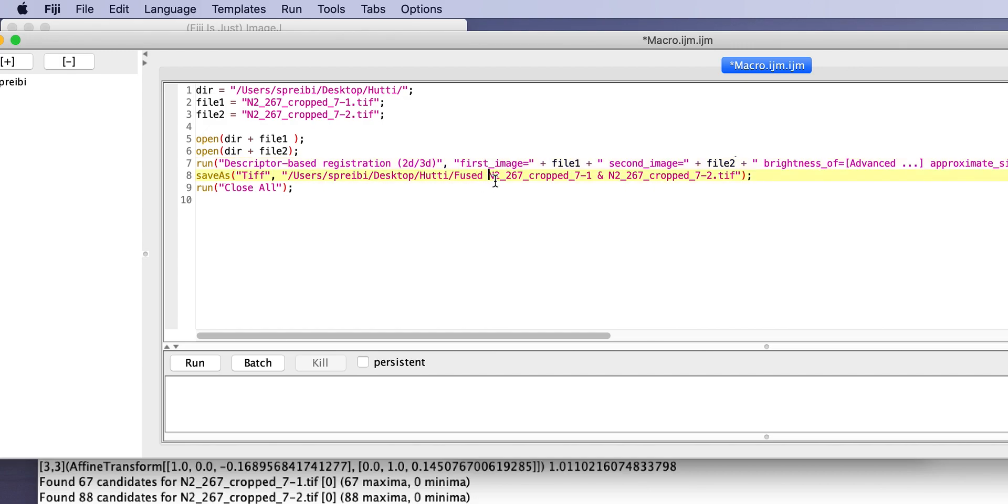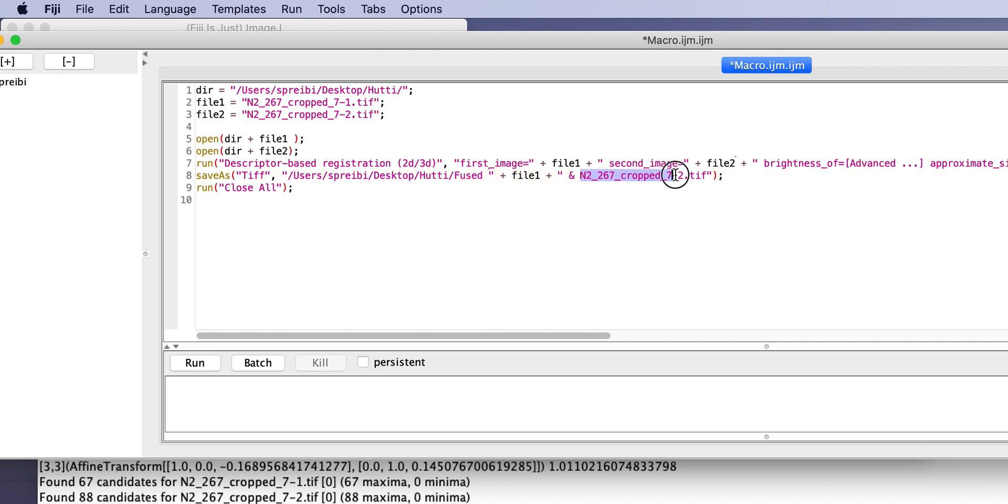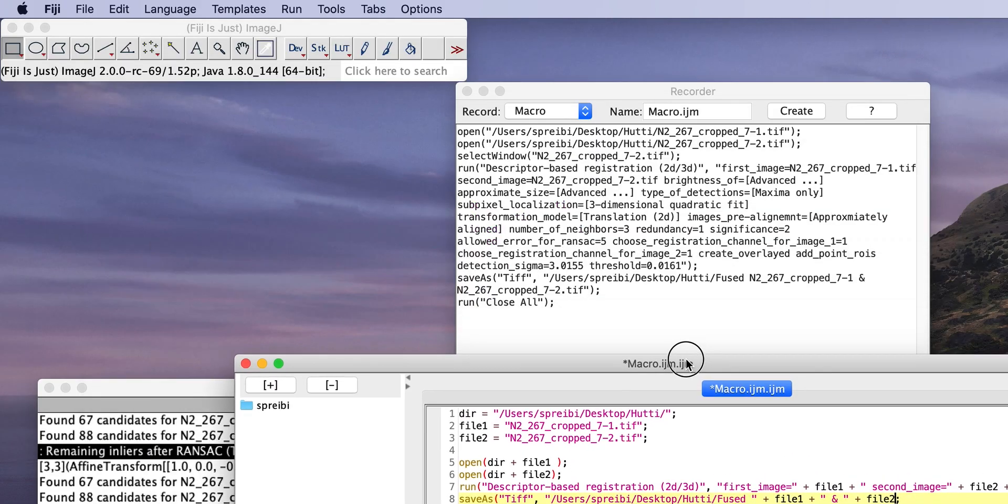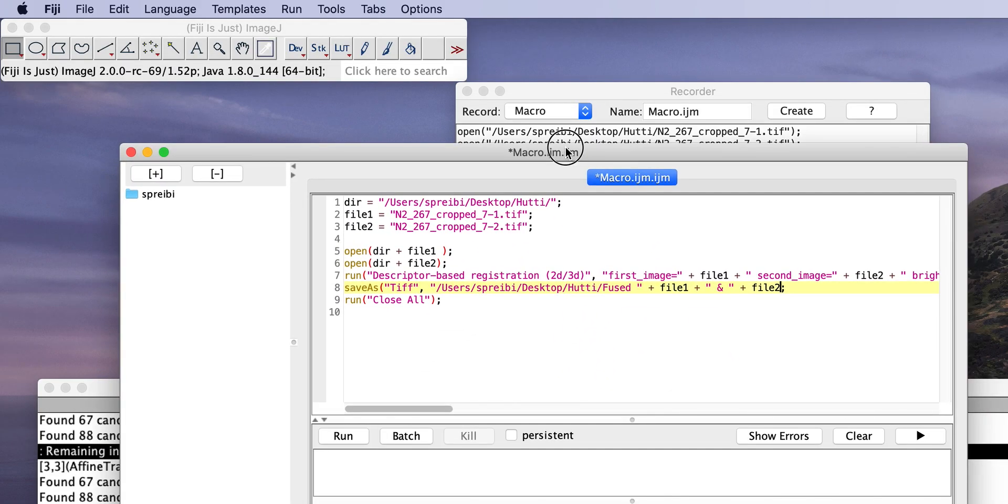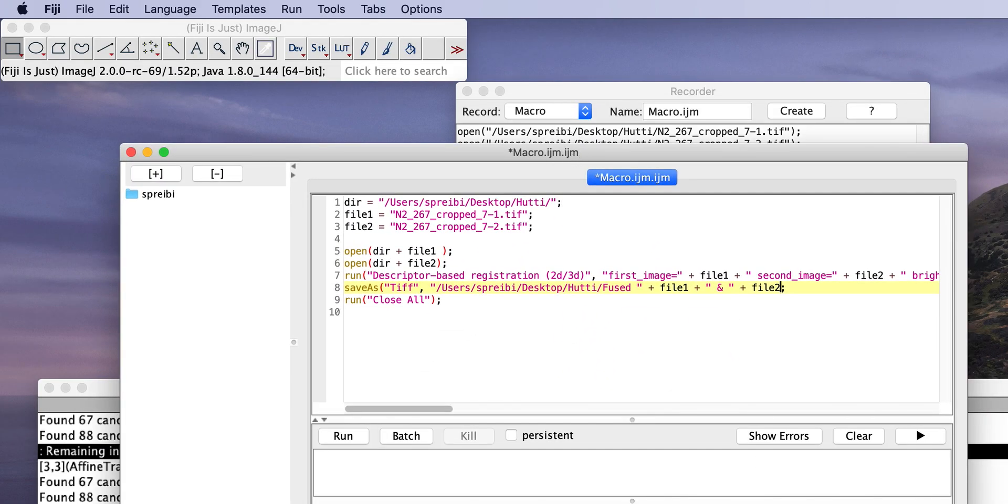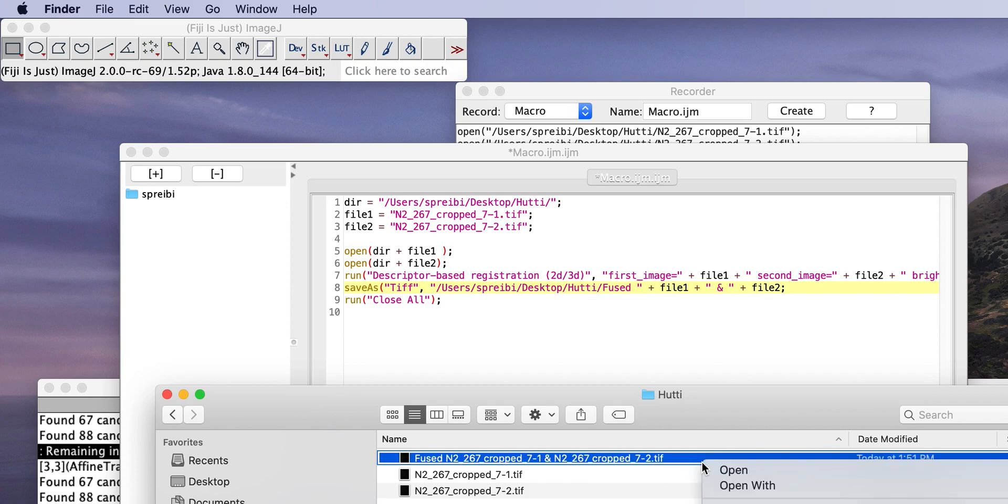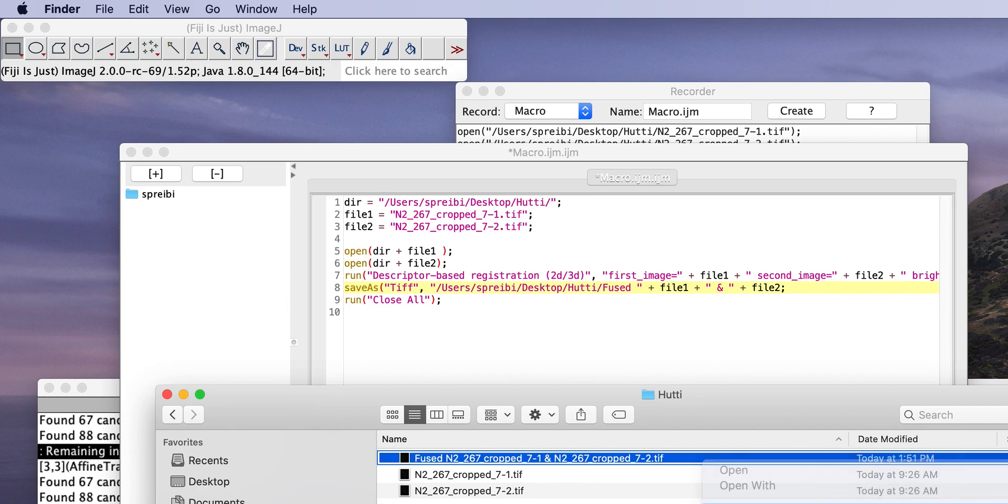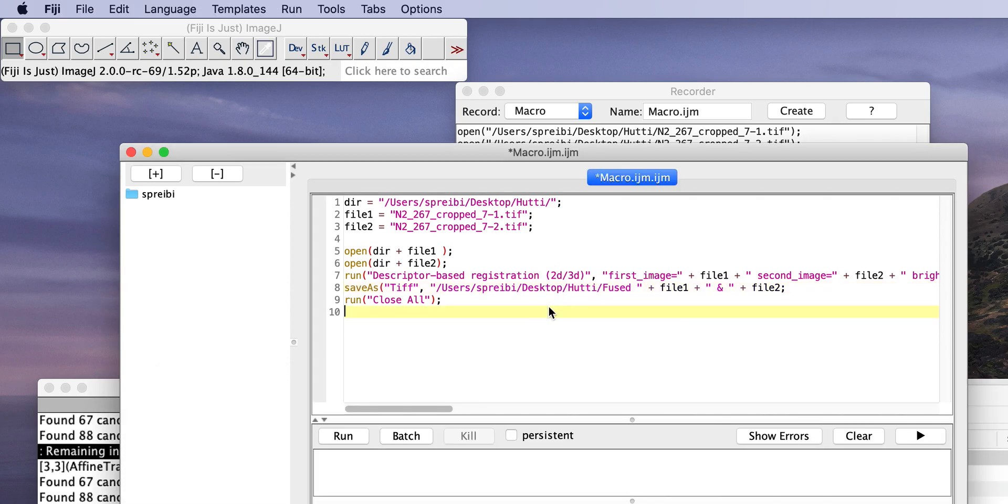So, this is basically the fused. And then, we have file one and we have file two. So, that's it. That should now run automatically. So, let's see if that works. So, we look in the folder. I remove this again. So, we run this. We have a little error.